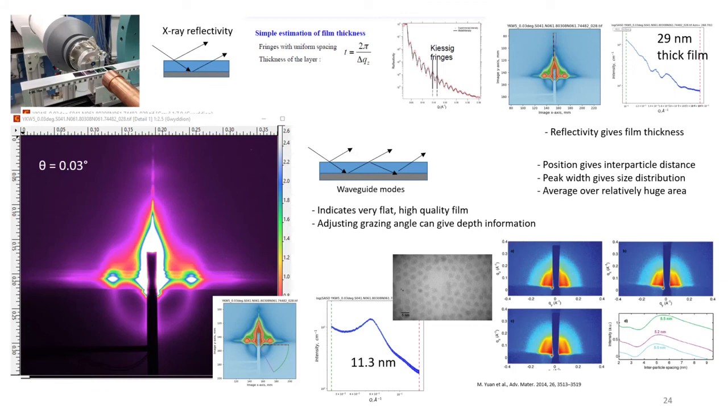And yeah, if you wanted to get some depth information, you can adjust the grazing angle too. But this is really more than I tell them, oh, well, you can see these things. They're like, we just want that. Just tell us that number.